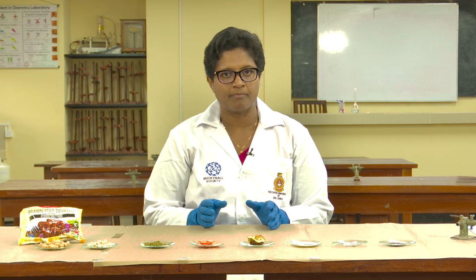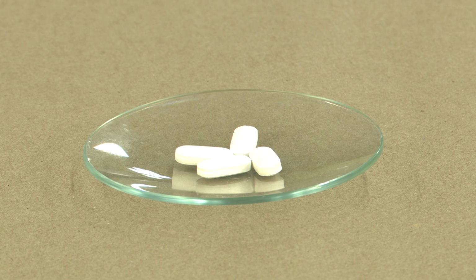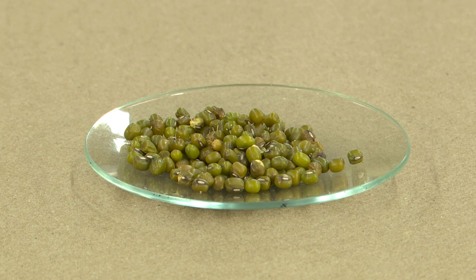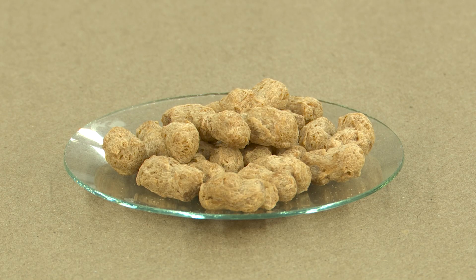The Kjeldahl method can be used to analyze the protein content of a wide range of samples, tea leaf samples, any pharmaceutical products, any type of dairy product, any fruits and vegetables, and even any type of grains, and a soya meat sample as well.